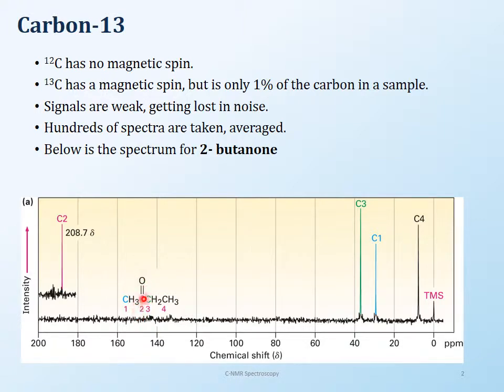If there was no carbon-13 on this carbonyl carbon, you will not see that signal at all. So that's what it means by a carbon-13 NMR. Here you have 4 different carbons, so you see 4 different signals. The signals appear in the same way as they did for the proton NMR, which means that you have the shielded region and then you have the de-shielded region.